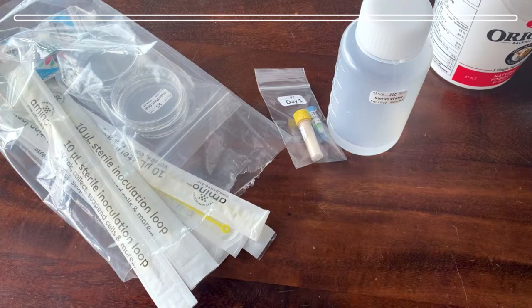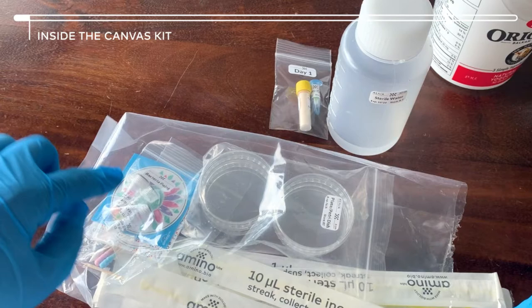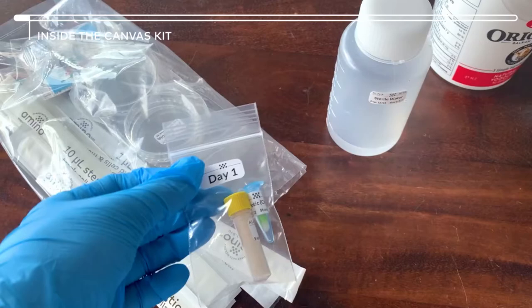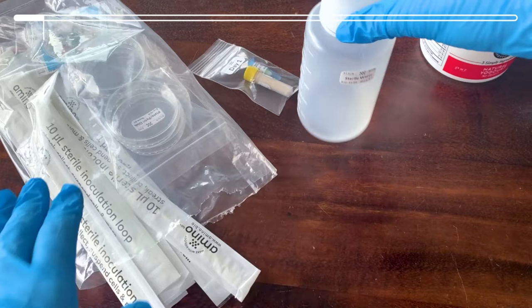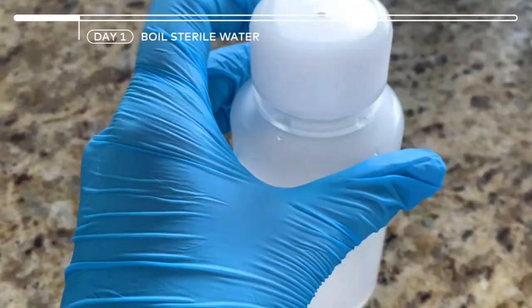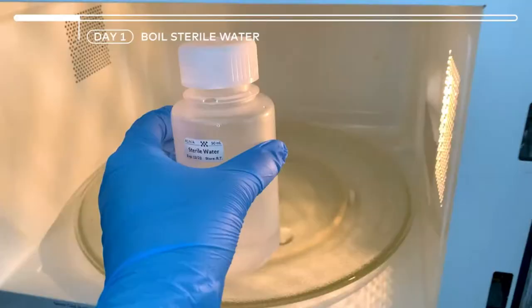First, let's see what we have in the Canvas Kit. So we have the petri dishes, we have the paint, the canvases, we have the loops, the day one package that we are going to use today right now, and we have our sterile water. Also we have an activation bag that I put in the yogurt container so it's easy for us to use it.